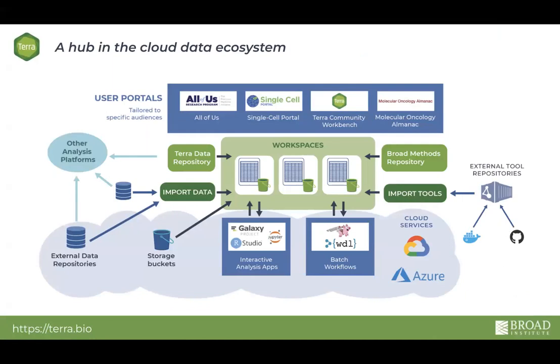So all of this is made possible in addition to all of the wonderful design work that we do here at the Broad. It's also made possible by the fact that Terra is part of this large ecosystem of data. It's an open ecosystem, not an island. You can find and access data, but also bring your own. You can access tools and bring your own. You can perform analyses and share them securely. And like I said, it's modular and standards-based and has many open source components. So that means you have flexibility to do many, many things. And that includes building for multi-cloud capabilities.